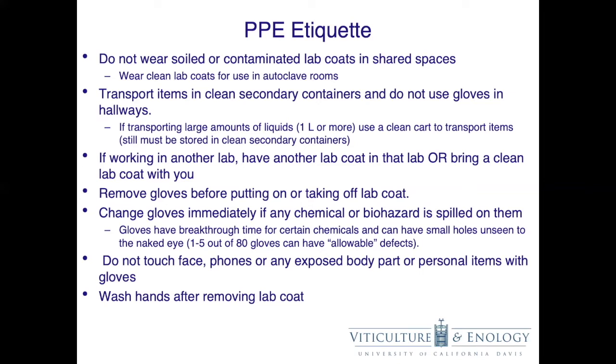Wash your hands after you remove your lab coat. The idea is that your lab coat is contaminated, so once you touch it again, your hands are then contaminated. Washing your hands after removing your lab coat removes any hazard that was on your lab coat from your hands.